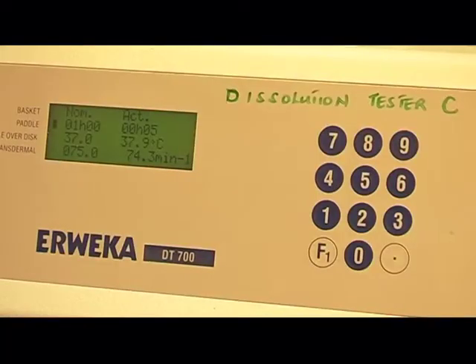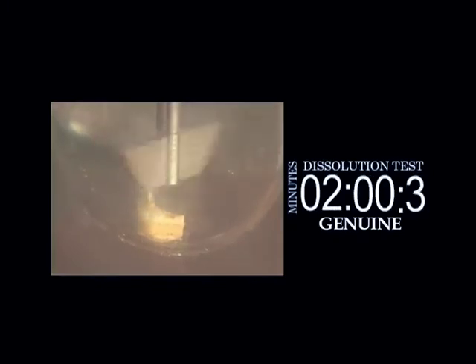The most simple exercise that can be carried out on any product will entail some element of determining the mass, and that is, I'd say, a test that is carried out on all products that we analyze here. The dissolution test is a test that is designed to determine how well tablets or capsules is able to release the active ingredient once it has been swallowed by the patient. See these 2 tablets? One is genuine, just how it works inside your stomach. The other is not.